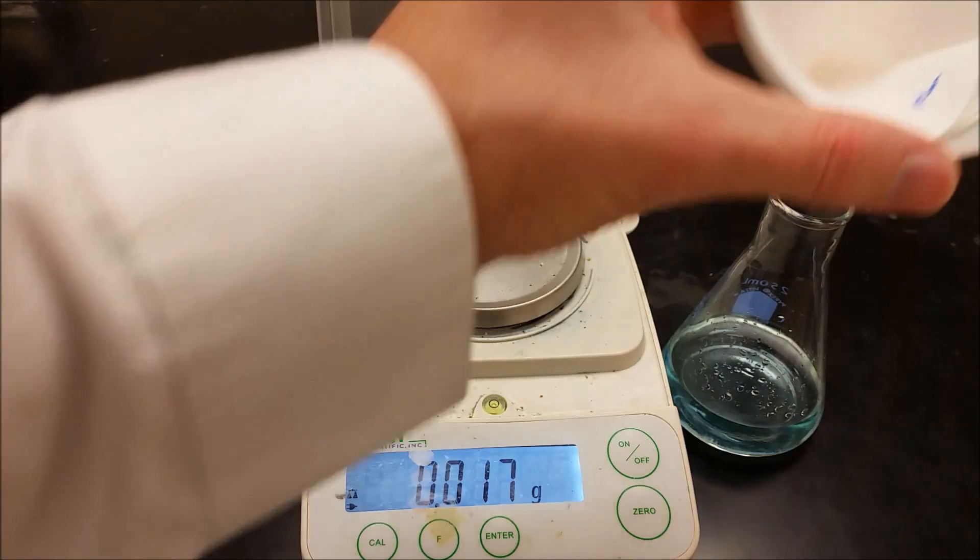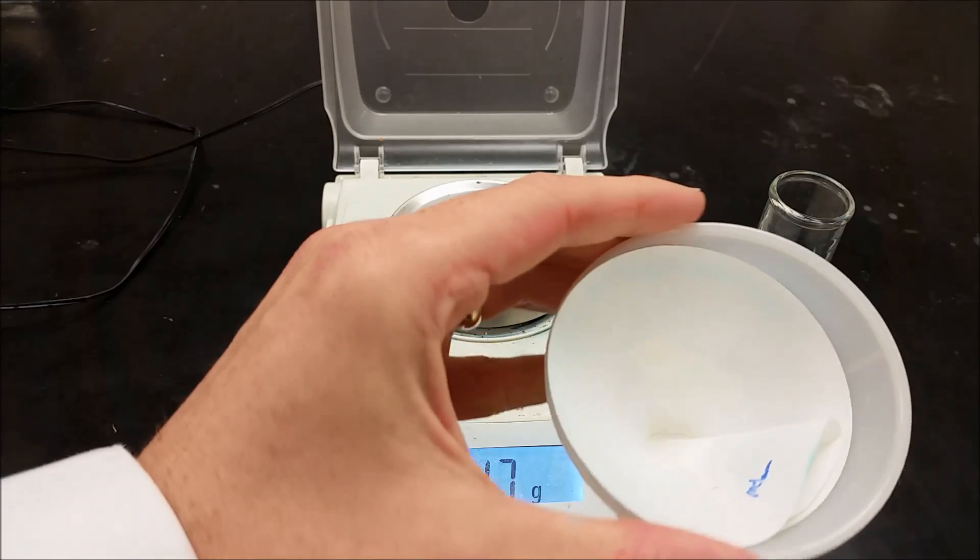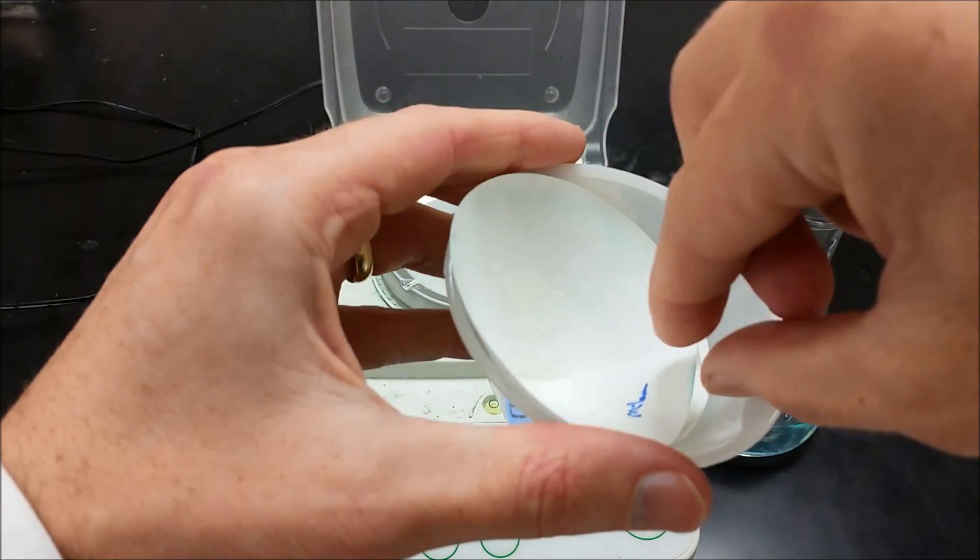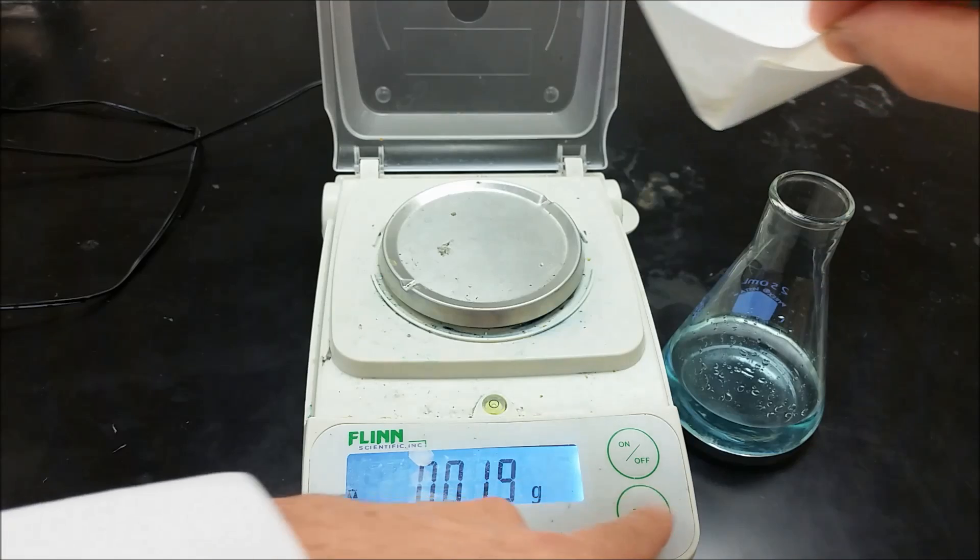So now that we're done and this is dried, we have our white barium sulfate salt. I'm going to take that and get our mass of it.